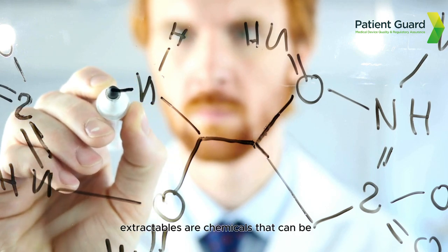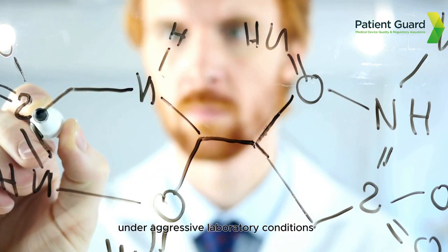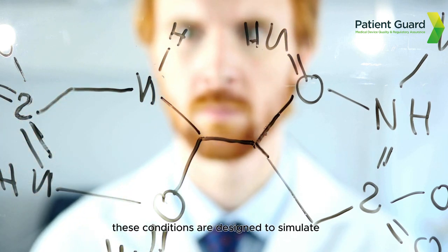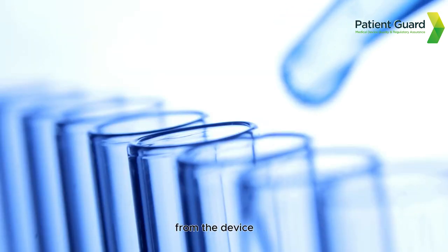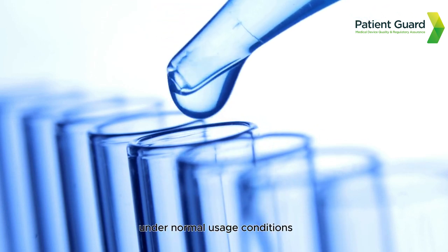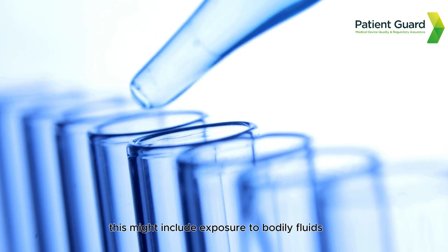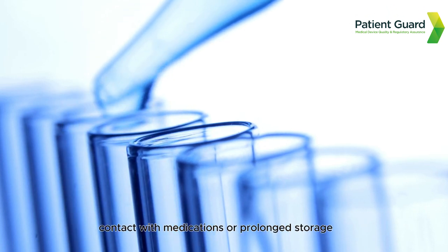Extractables are chemicals that can be extracted from device materials under aggressive laboratory conditions, such as high temperature or solvent exposure. These conditions are designed to simulate the worst-case scenario of chemical release from the device. Leachables, on the other hand, are chemicals that can migrate from device materials under normal usage conditions. This might include exposure to bodily fluids, contact with medications, or prolonged storage.